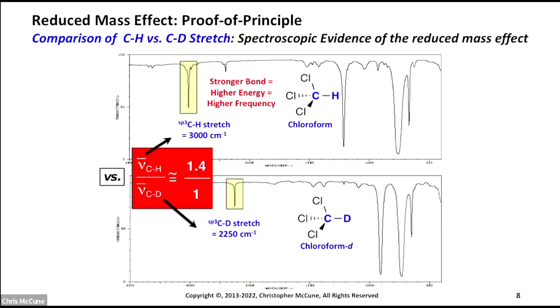The CL stretches show up down here, and so I've kind of left them out of the picture. We're really just focused in here, and then a roughly 2100 to 2200. And that's about where we show up. We see a different stretch for the CD stretch.